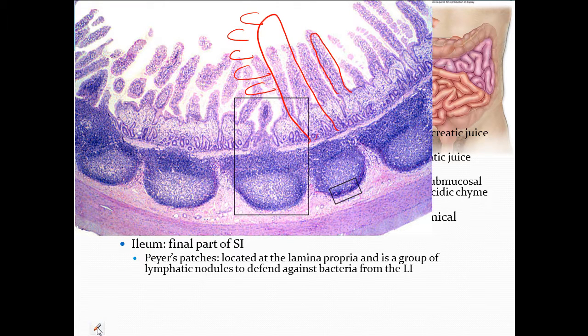And to also distinguish it, if you look at this, it's not the microvilli, it's the simple columnar epithelium on the surface of this, which is not that zoomed up. Then you could see the microvilli or the brush border.